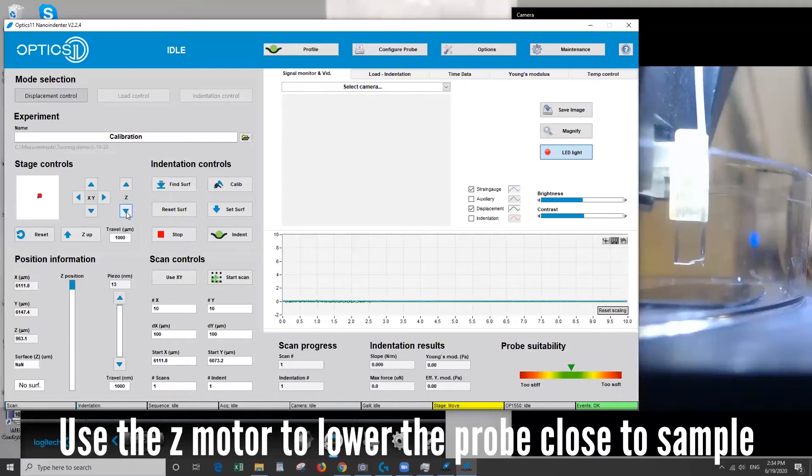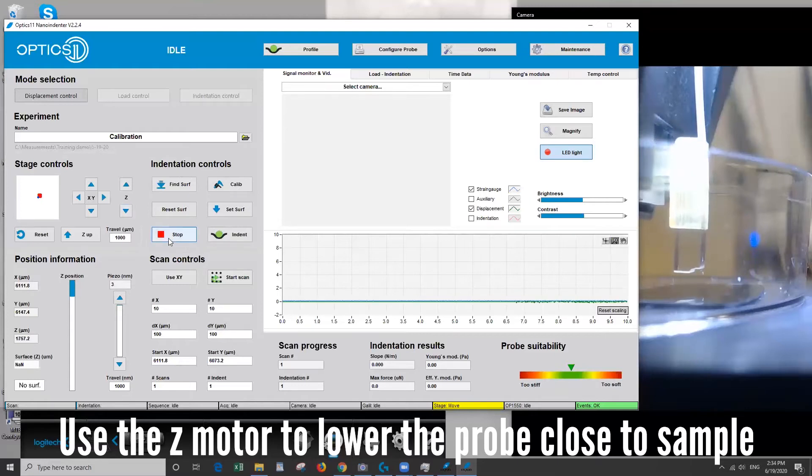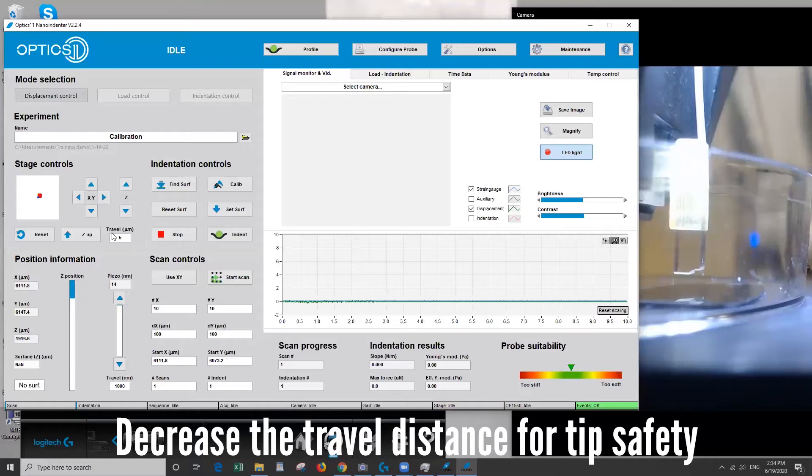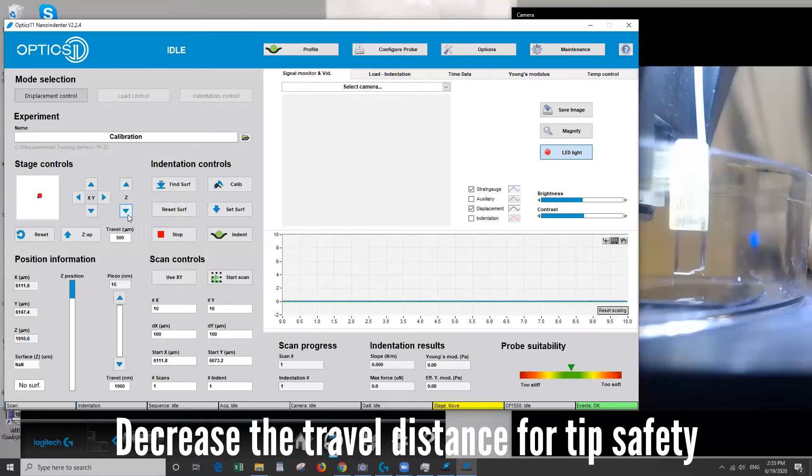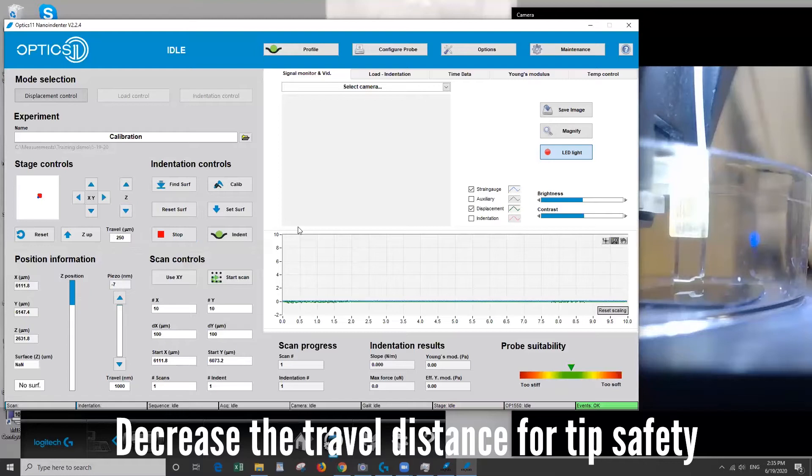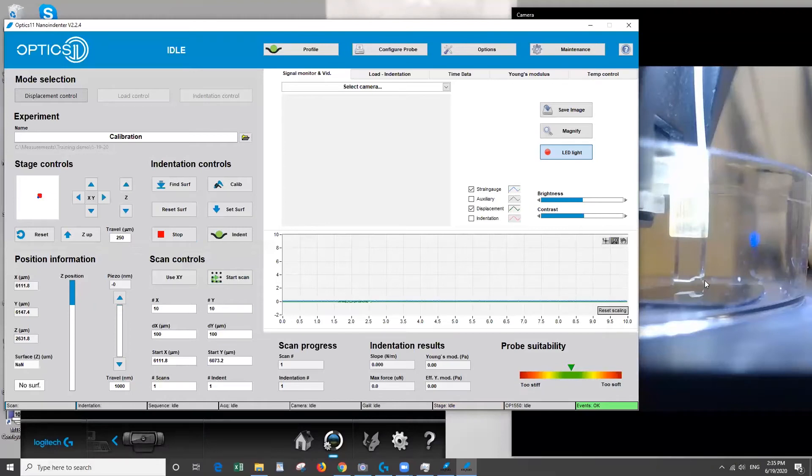So let's go down again. Okay so I don't think we could travel another thousand without crashing so the closer you get be safe and lower the travel distance. Okay so here you can see the reflection of the tip and the actual tip are pretty close so I think that's a good distance to leave for the instrument to do an automated approach.